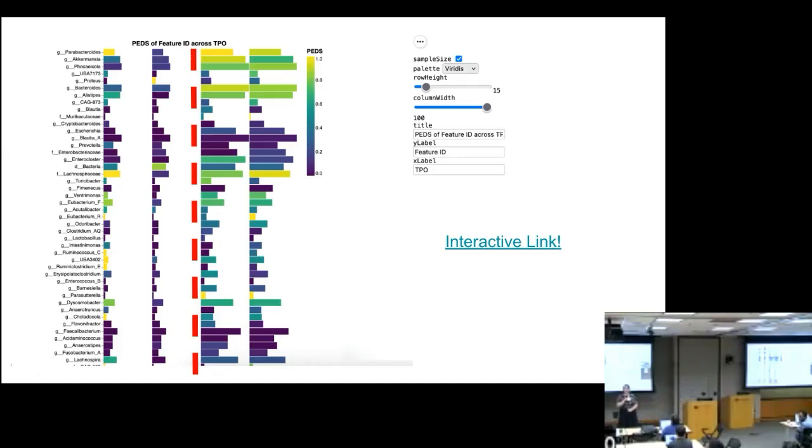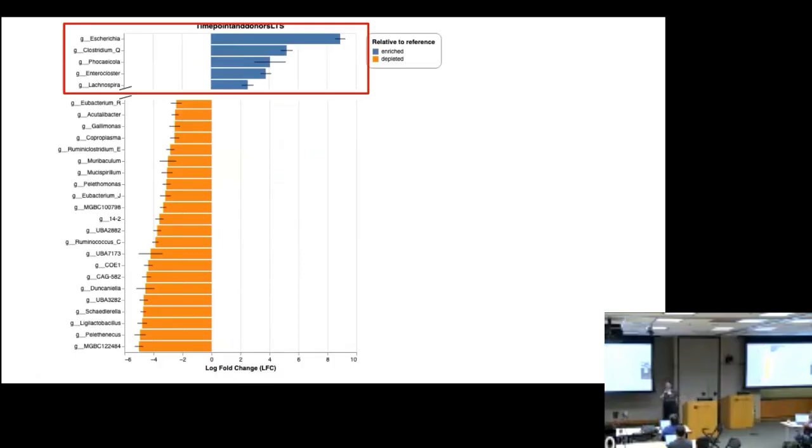How do you know if a species increased? So this one doesn't really tell you if a species increased. What I typically do is track it over time. I tend to use Q2 longitudinal and use my feature table as metadata and hand it in. I take one of these features that I've identified as being important to the donor, track that abundance over time, and see if I can see a change, to make sure that our recipients end up with some of these microbes.